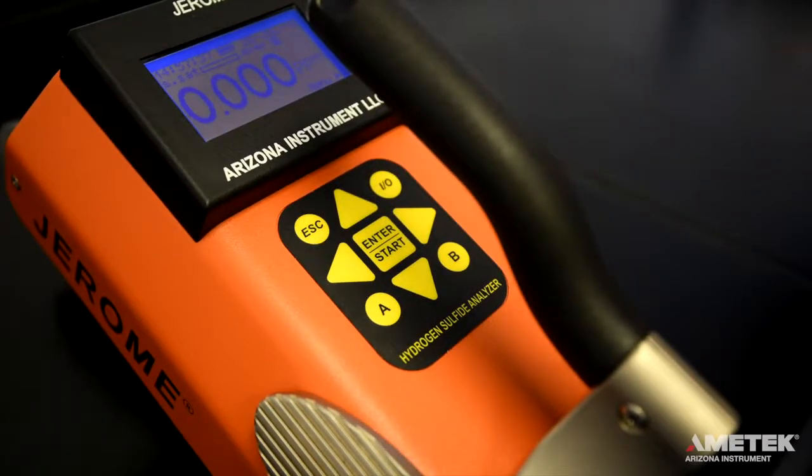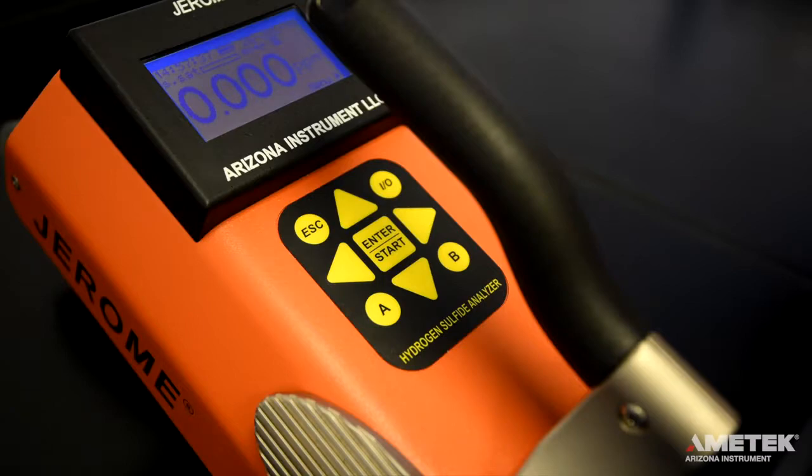The display should read 0.000 ppm. On the main menu, you will see the date, time, battery life indicator, test result, result units, sensor saturation meter, and menu link.